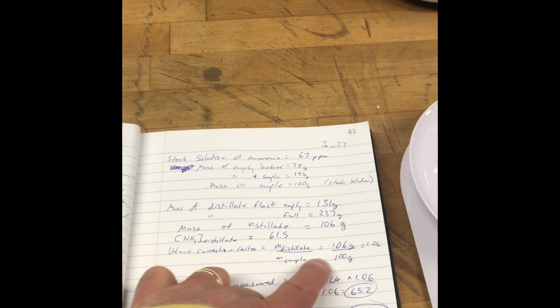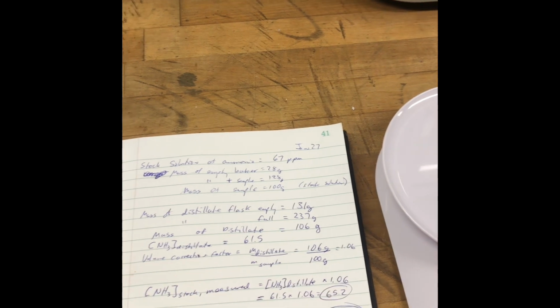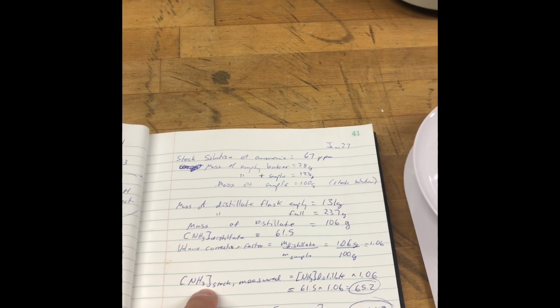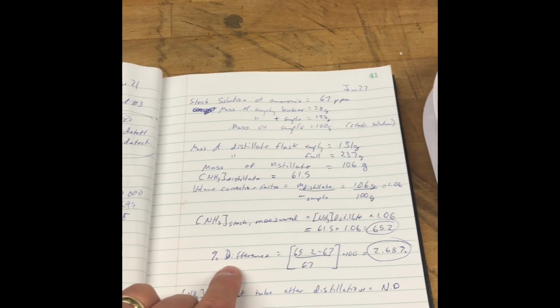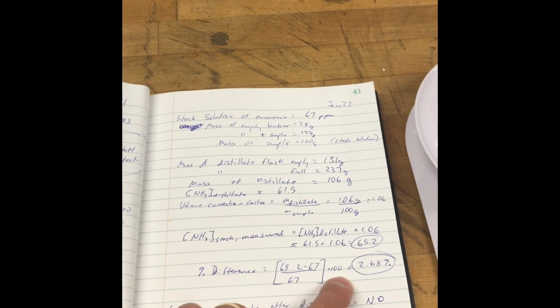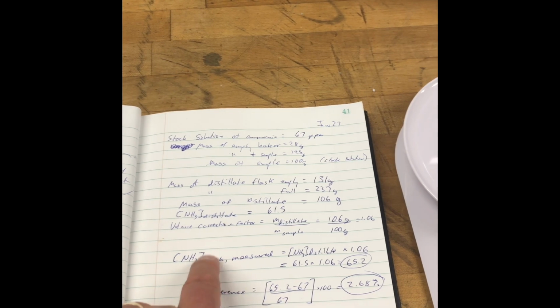I have to correct for the difference in volume for those two, so the calculation is the mass of the distillate over the mass of the sample, which is 106 over 100, which is 1.06. So my calculated ammonia concentration in the original sample after distillation is the concentration of ammonia in the distillate times the volume correction factor, which is 61.5 times 1.06, which is 65.2. Percent difference is 65.2 minus 67 over 67, which is 2.68%. So very good agreement between the known concentration of the original sample and what I calculated after my distillation.